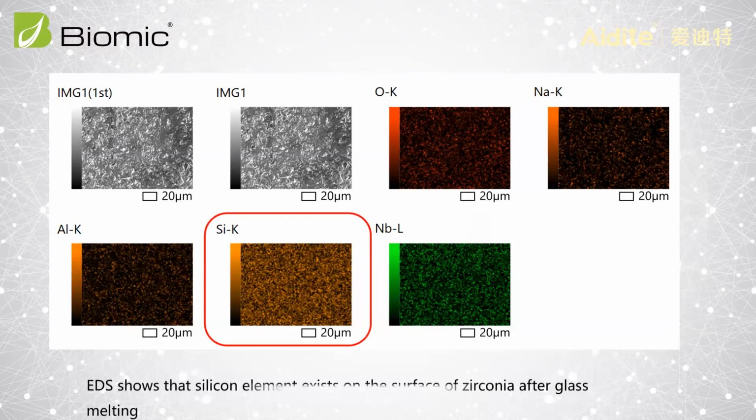Also, under the EDS, we found silicon elements. This part is very important because it works with the bonding glue.